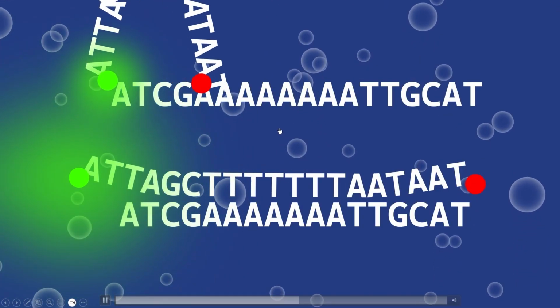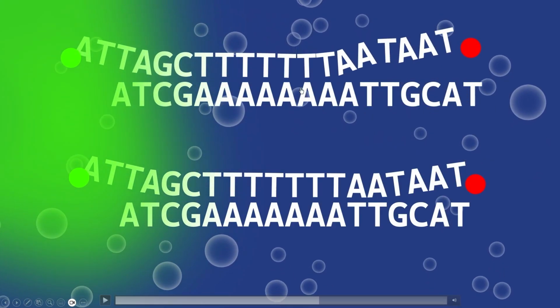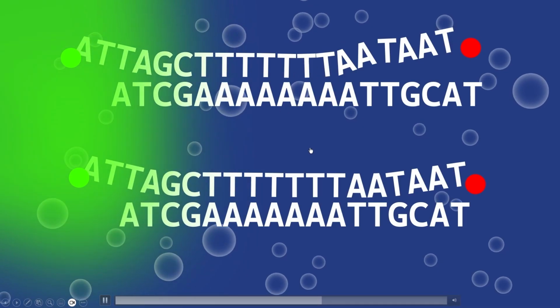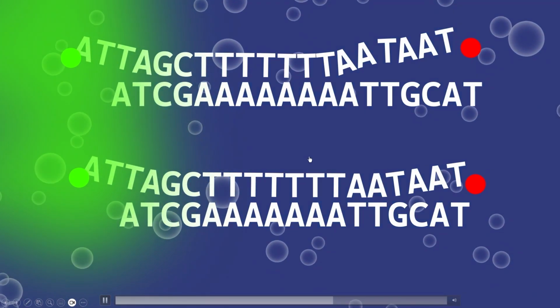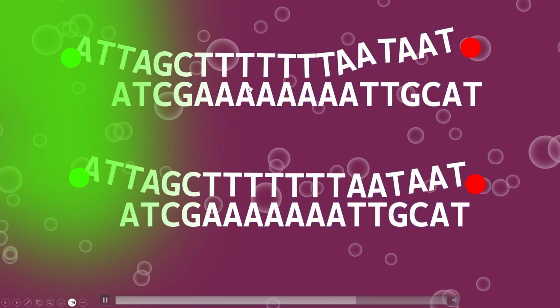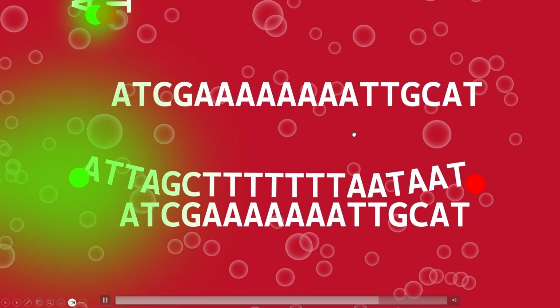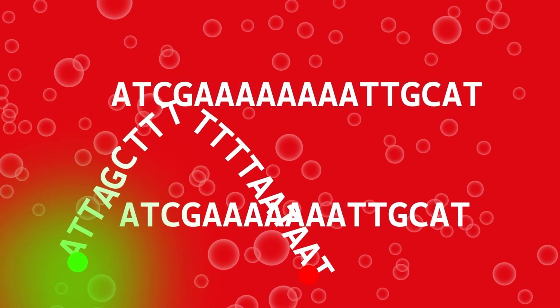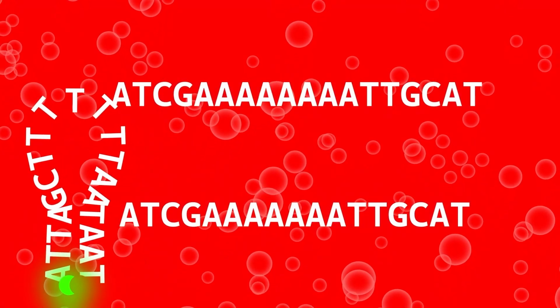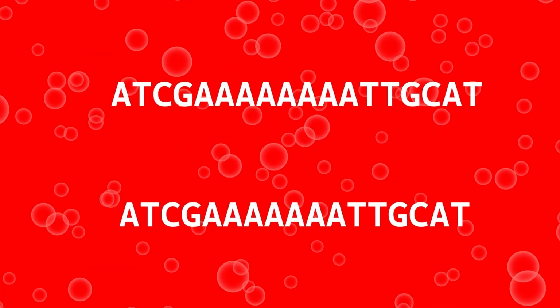So if you remember the melt curve basics, it can still bind usually when there's like one mismatch or so. So the one that's wild type up here, it can still bind, but it's going to be a little bit weaker because it's not as good of a match. So then we're doing the melt curve part. We're slowly heating the mixture. The imperfect match, the wild type, is going to fall off sooner. And then the mutant, the one with the one base pair deletion, is going to fall off later. And so you can look at the different melting curves and figure out which it was, wild type or mutant.